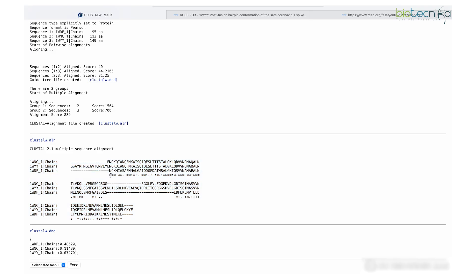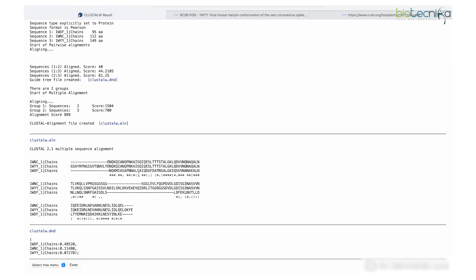The ClustalW output format uses specific symbols: an asterisk signifies that all sequences are the same at that position — those are conserved or identical residues. You can see the exact amino acids are identical at those positions. Then you have conservative mutations and non-conservative mutations. You may also encounter gaps, since the sequence lengths are not the same. The second sequence appears to be the longest, which is why other sequences start where they find the best configuration. This shows how much is conserved and confirms a relationship between all three sequences.